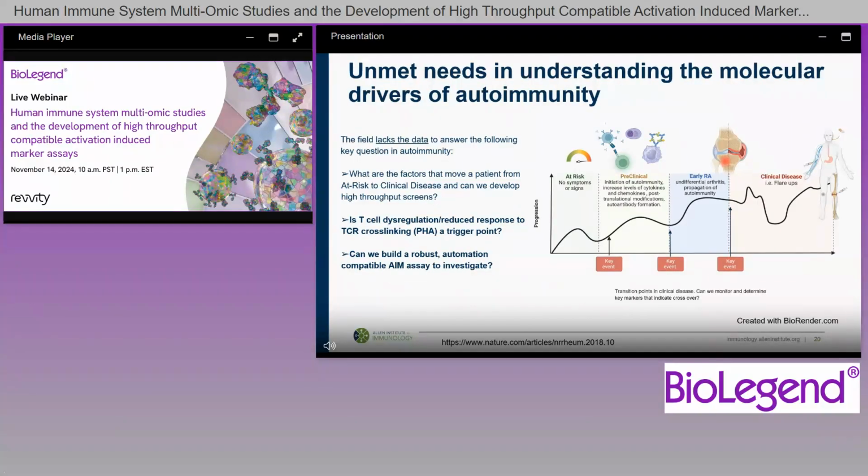After knowing that the PLX is capable of detecting core immune cell subsets, Tyanna and I wanted to focus our assay on T cells, specifically on T cell activation with PHA. We wanted to compare activation of healthy patient T cells to that of diseased patient T cells, and we decided that rheumatoid arthritis would be the disease that we focused on.